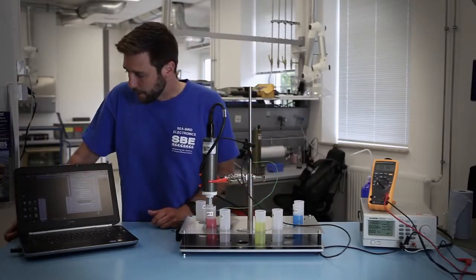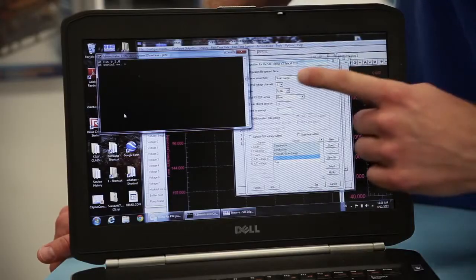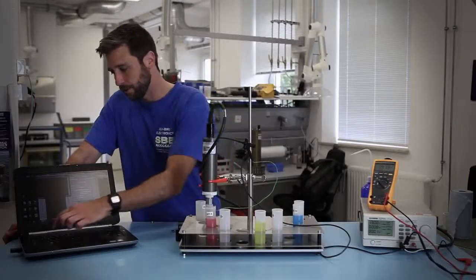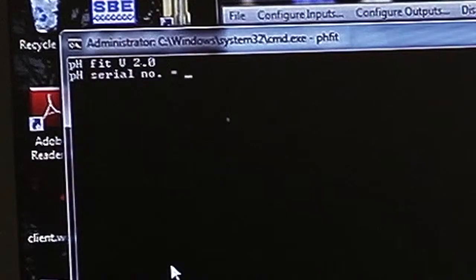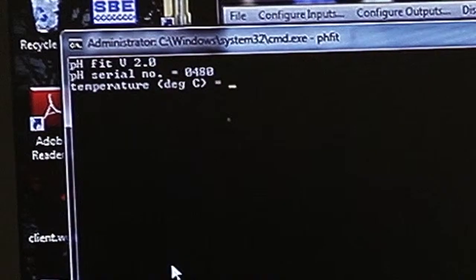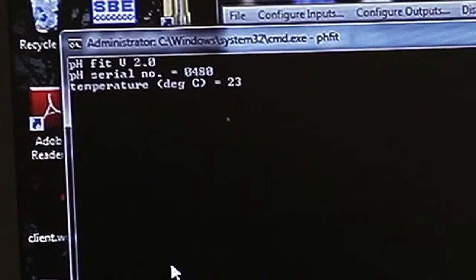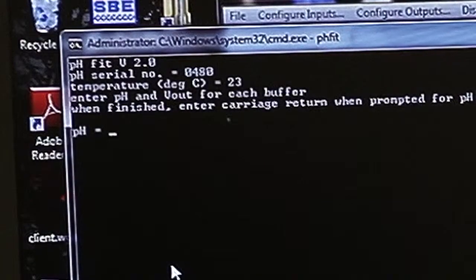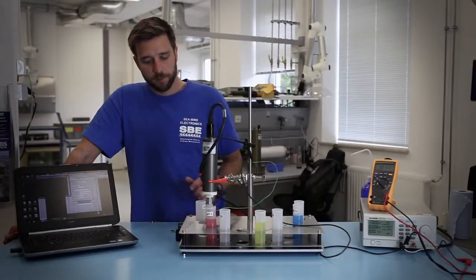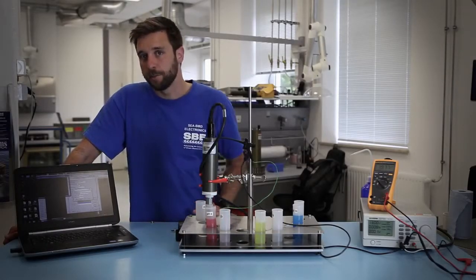When you bring up pH Fit it's going to ask you for the serial number of the sensor and the ambient temperature, which you want to be about the same temperature as your pH buffer solutions.